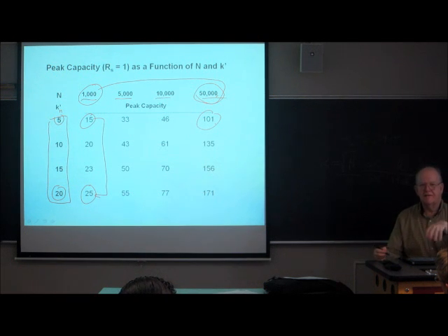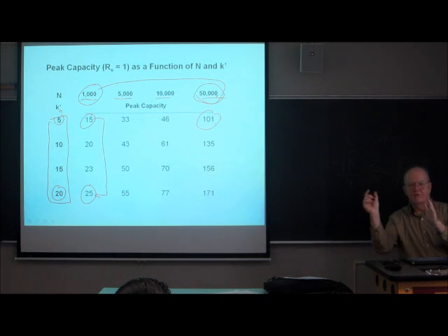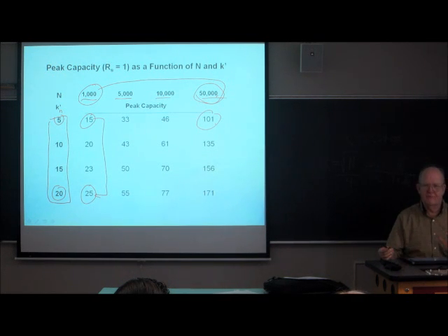Unfortunately, this is the best possible situation because you've assumed that the peaks are willing to just line themselves up and come out lockstep, all perfectly, 1 unit of resolution, 1 unit, 1 unit, 1 unit. Mother Nature doesn't give you samples that look like that.